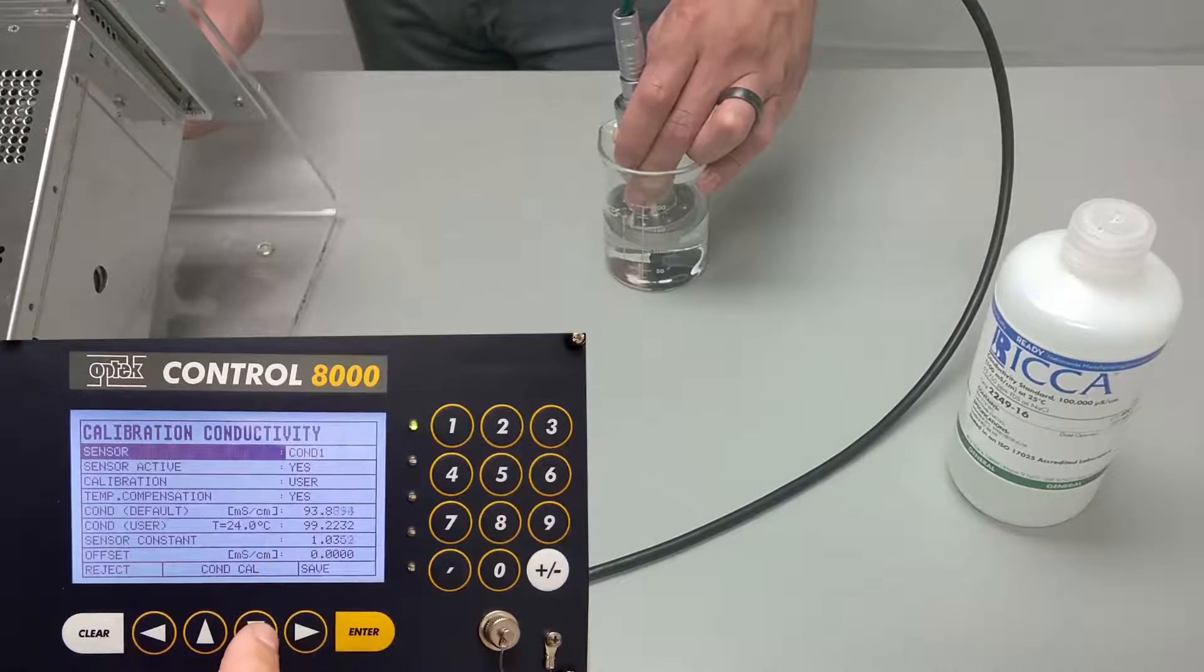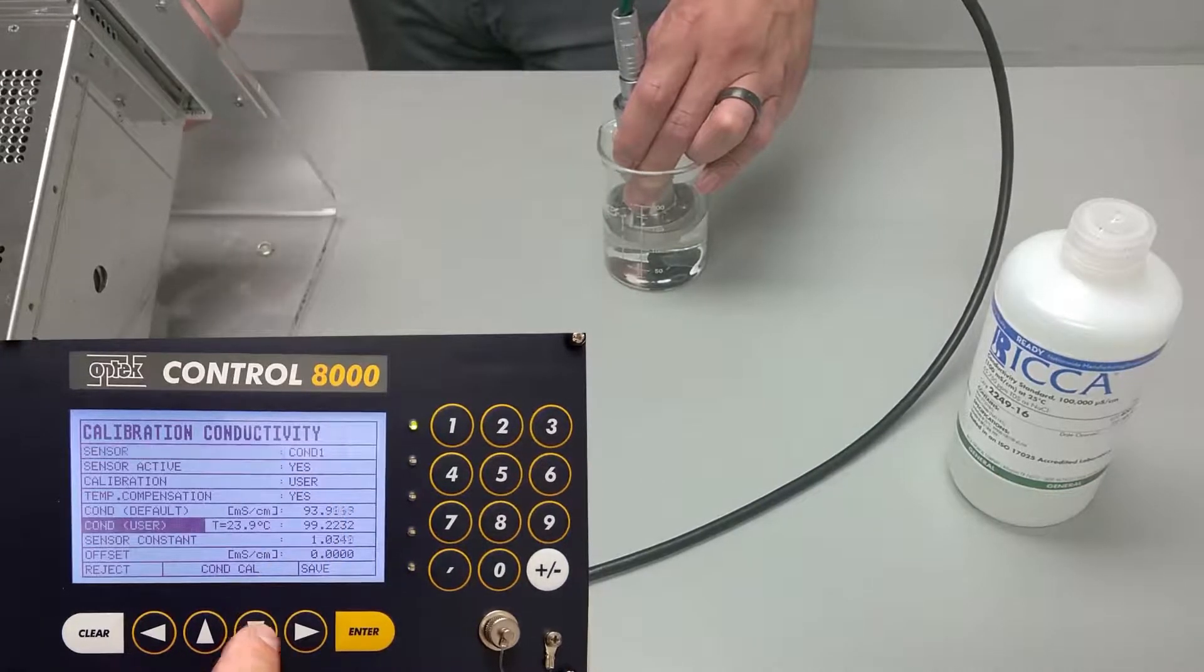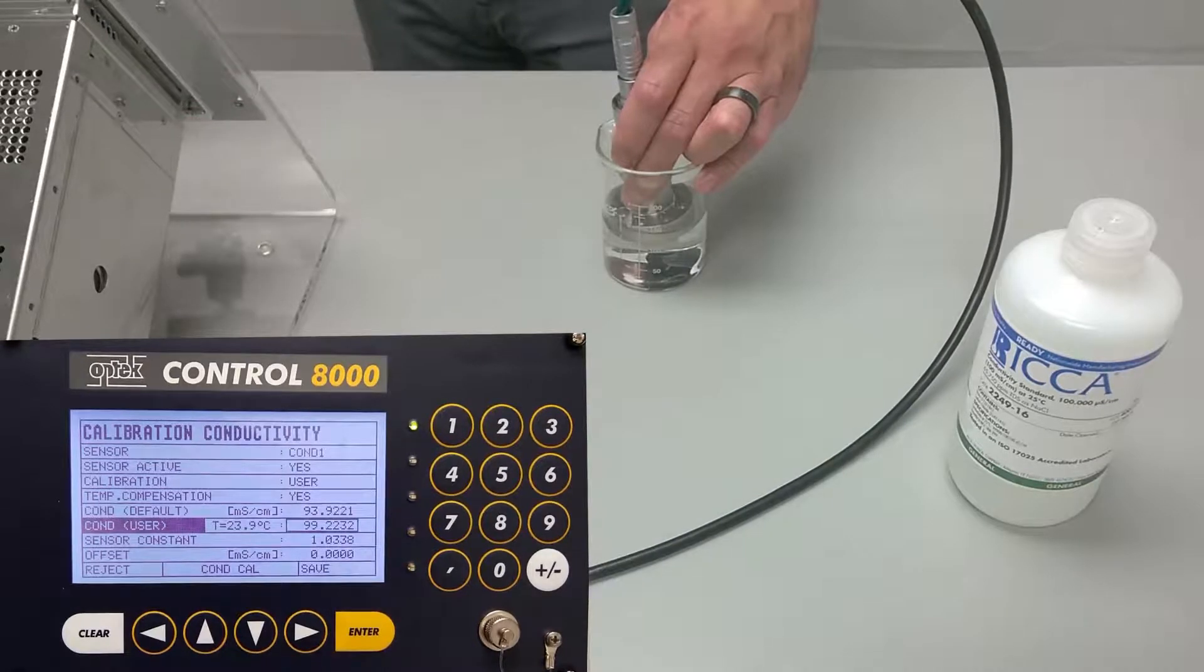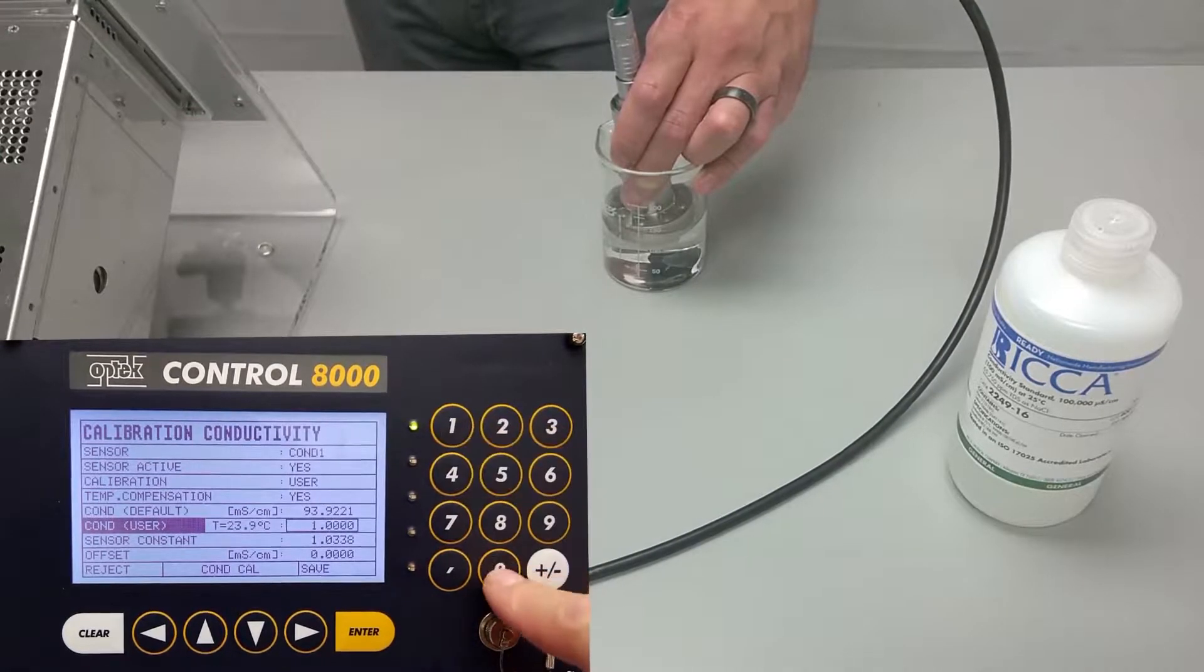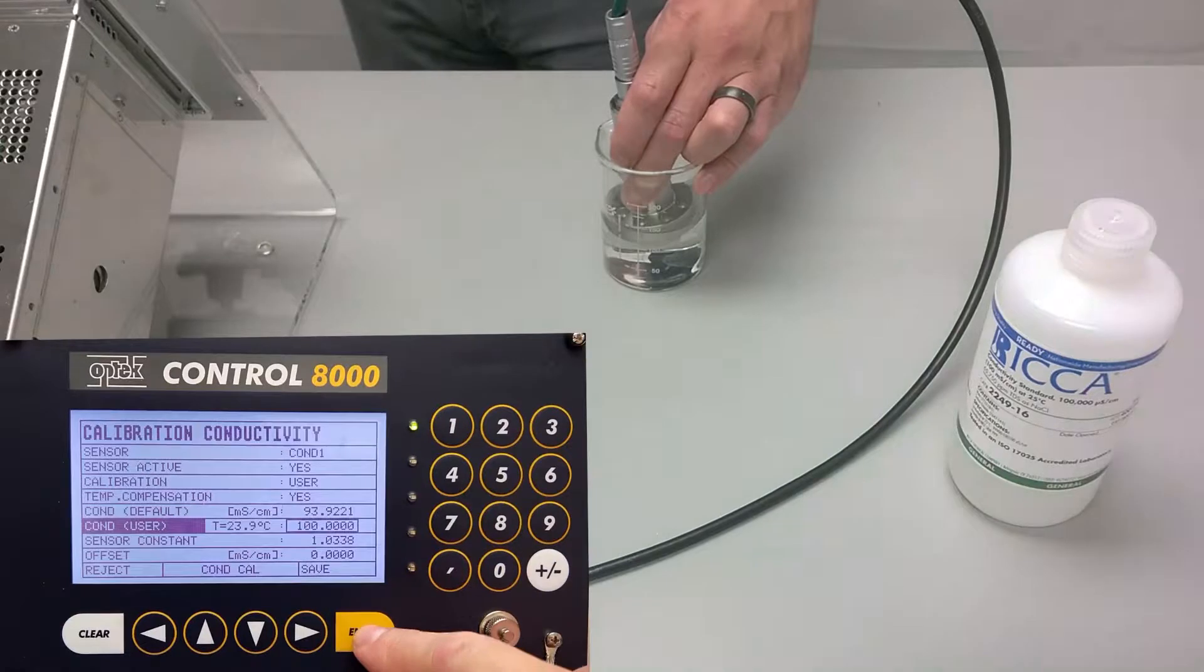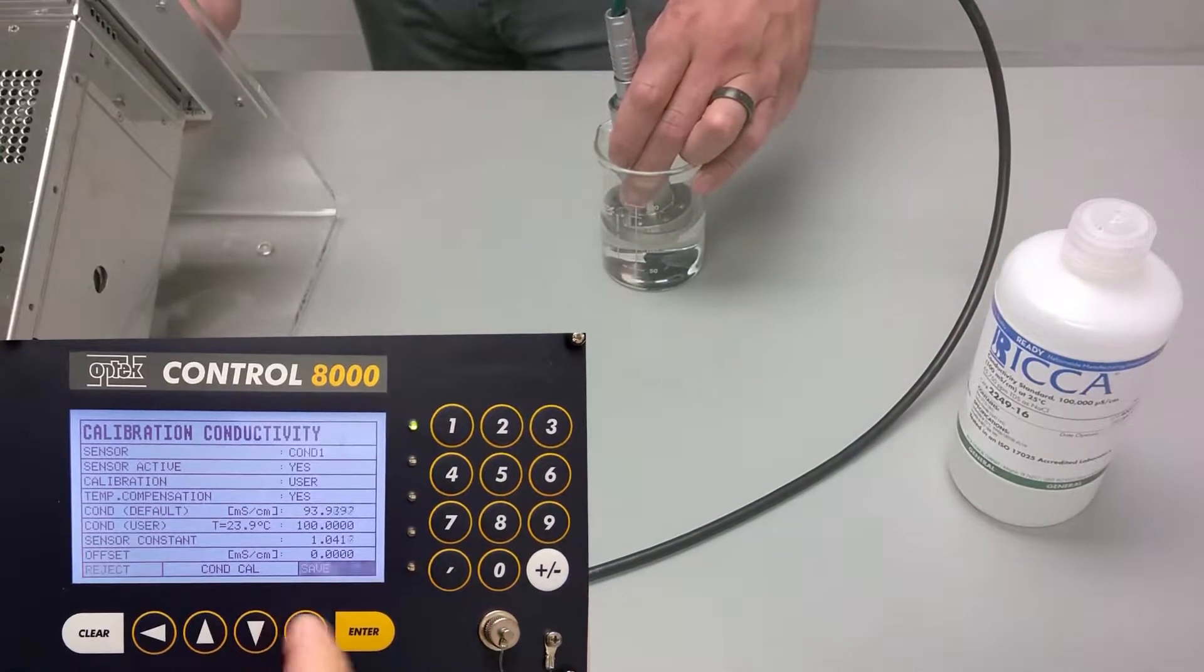COND1 is selected. Scroll down to COND user and press enter. Enter the nominal value for the conductivity solution of 100, press enter, then scroll down and save the changes.